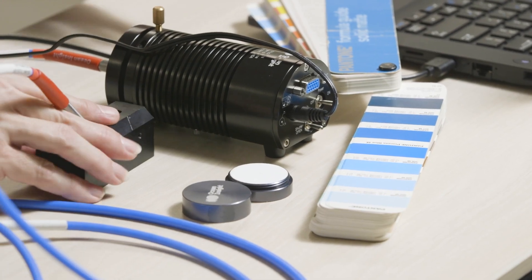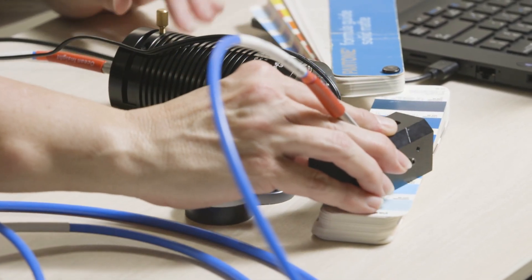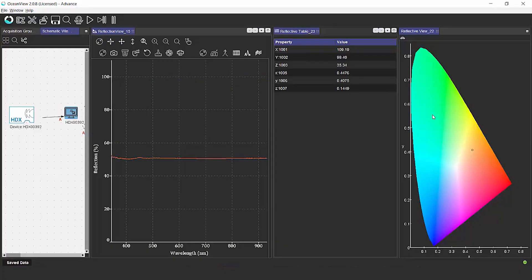To make the measurement, all that we're going to do is place our probe holder directly on the sample that we want to measure. And as you see in the software, we can see changes in the color values and also in the chromaticity diagram.